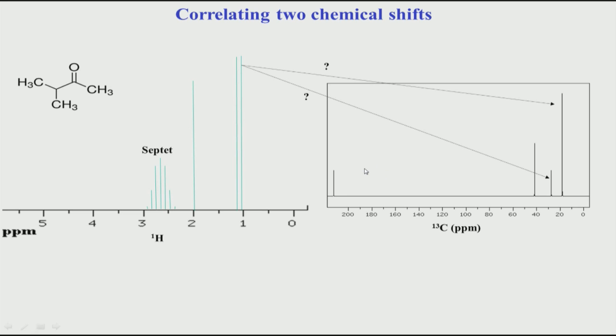But if I do a 2D, I should be able to find out. So, that is the question. Suppose I label this, let us see how a 2D will help us in this information. Right now, keep in mind we are only going through the idea of how 2D can help us to resolve this. As we go along, we will see more details of 2D.